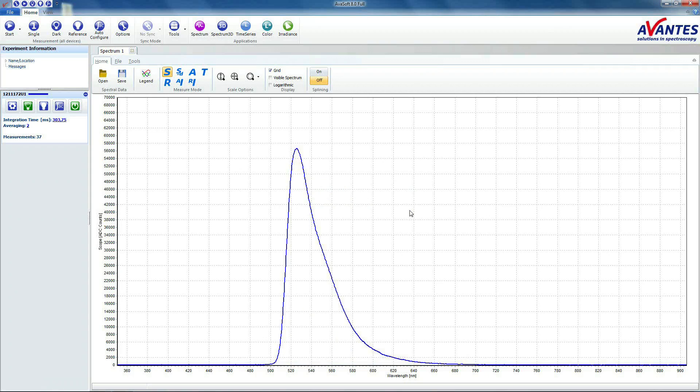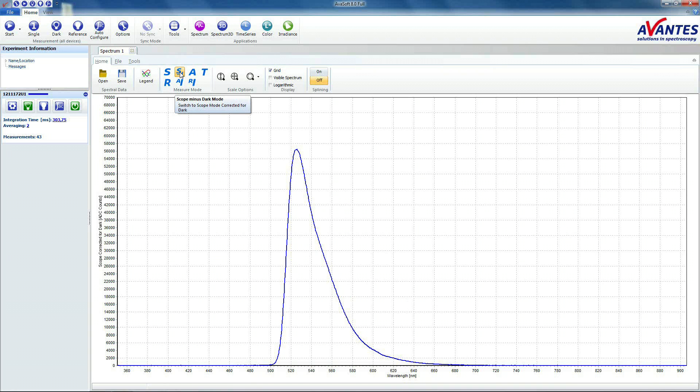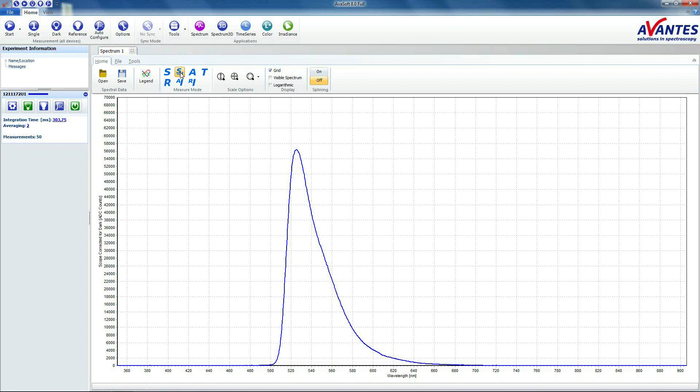Click the Scope minus Dark button to subtract the interfering stray light from your measurement results. This is the fluorescence curve of the sample we are measuring. You can also save this data.